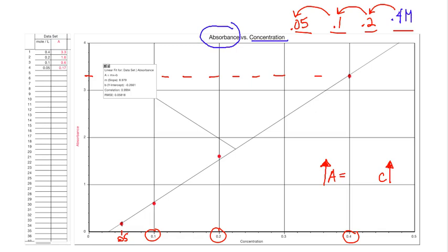Now, what do we know? Well, at this point, with this calibration curve, we've basically got our curve ready. If you look at your data here, and it's hard to see, the computer gave you your slope. We know that y is equal to mx plus b. Let me explain. This linear relationship between the known molarities that we calibrated our spectrophotometer with is called a Beer's law graph. Beer's law states that absorbance and concentration are a linear relationship.